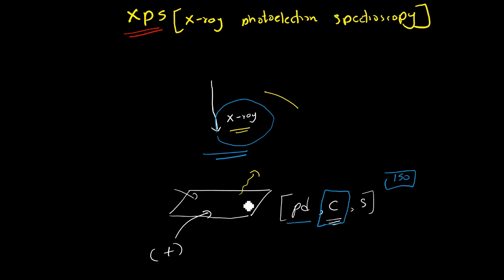You need to avoid that. You cannot make the surface positively charged, because it will change the binding energy. The more positive the surface is, the more binding energy it gets. The positive charge means electrons, which are negatively charged, find it really hard to overcome the binding energy, because the positive charge gives an extra attraction to the surface. So this will deviate our results.